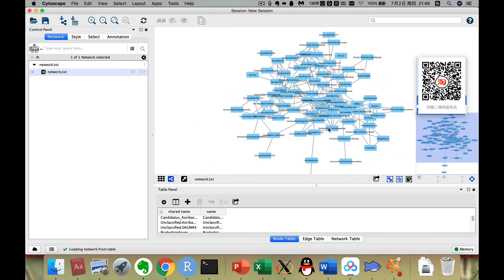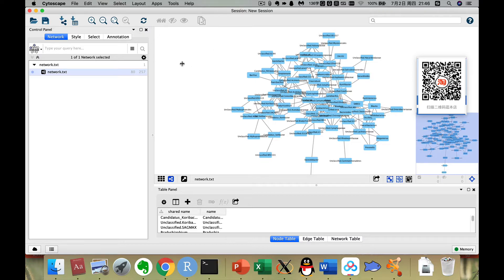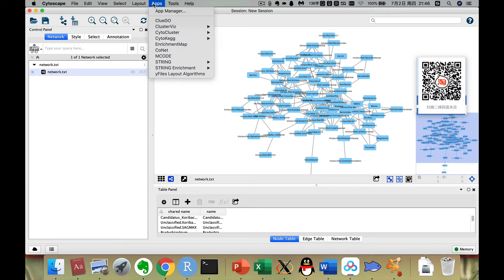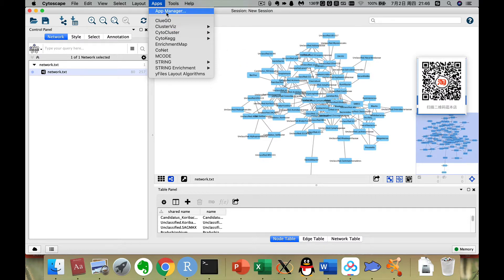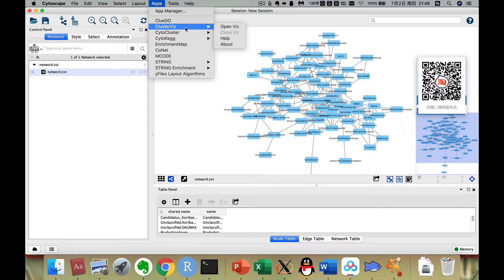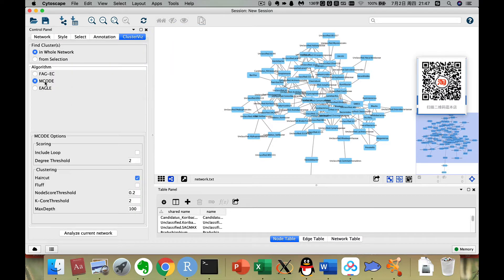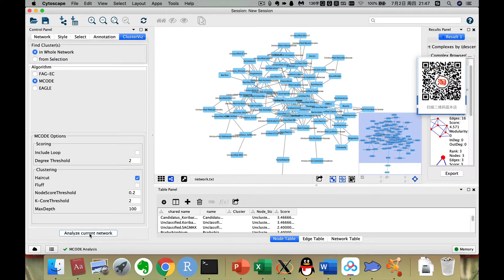Now here is the basic network. First, we calculate its cluster, its modularity. How many clusters does this network have? So we click apps. There is an app manager. If you don't have the clusterMaker in your Cytoscape software, you just go to app manager, then search this clusterMaker to install it. It will take a little while. Then you click open with. Now we choose the algorithm with MCODE. I often see it in some articles. So we click analyze the network.